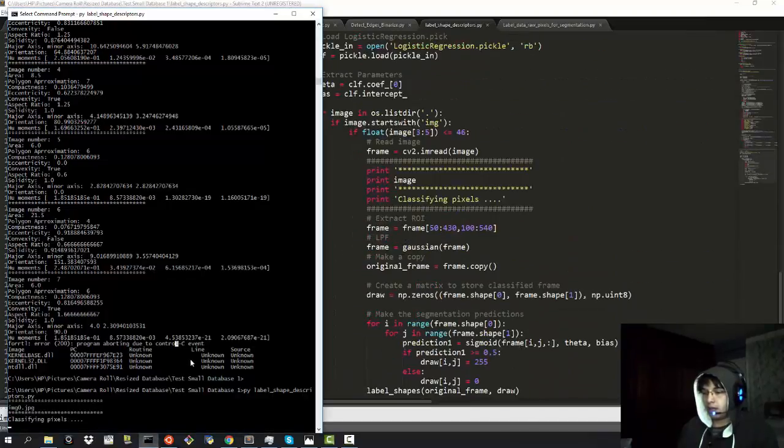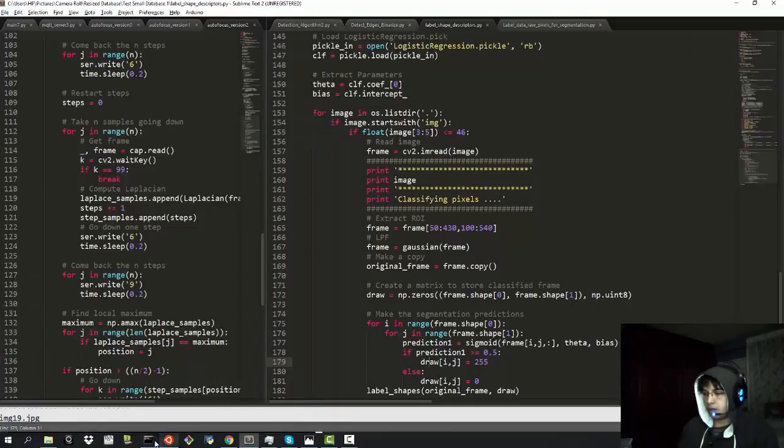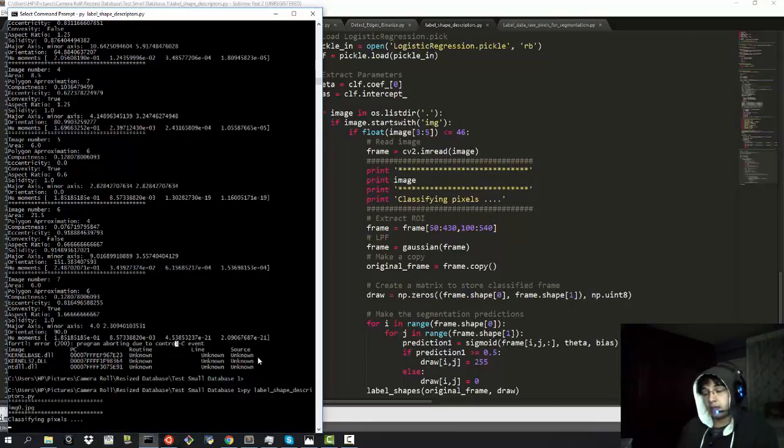I said that it takes 7 seconds, and that's right, because my tests are done with that. You can take the code and verify that, but for some reason, whenever I just wipe this and start it up, it goes very slow.